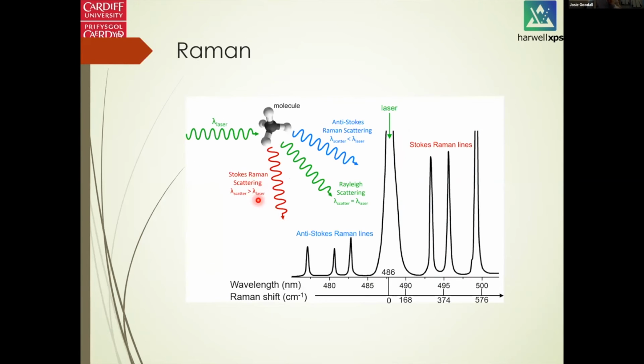So for the Stokes scattering, the light has a longer wavelength than the original laser source. Therefore, they will shift.